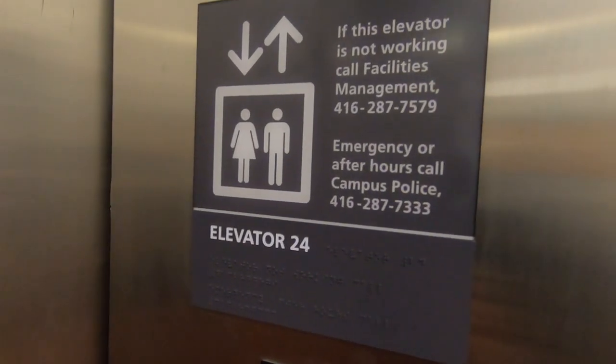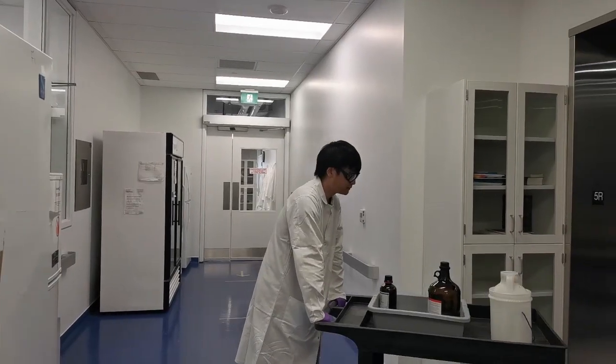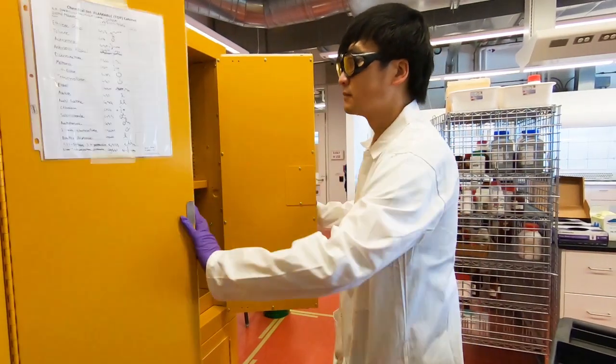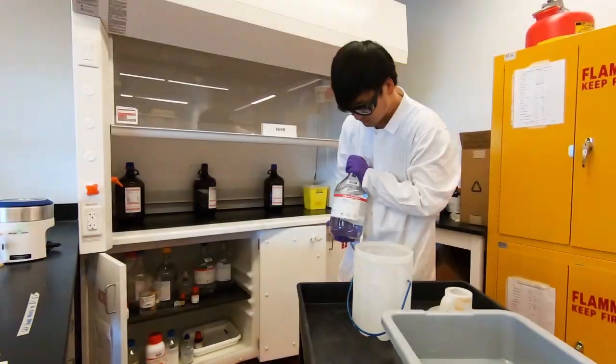Please note that in EV building, you must use the freight elevator only for any and all hazardous materials transport. Once you have arrived at your destination, carefully remove the bottles from the tray and/or the bottle carrier into the appropriate storage cabinets until further use.